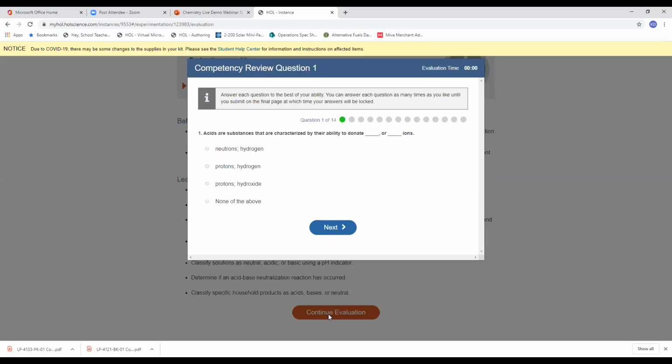So this is very much a lab practical, if you will, over just this lab. And these questions span the breadth of the lab. So they span things from simple definitions to experimental outcomes, to procedural protocols, to data analysis, and then to the student kind of visualizing and expressing what it all means.